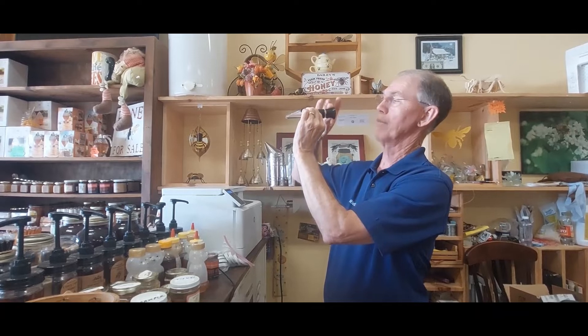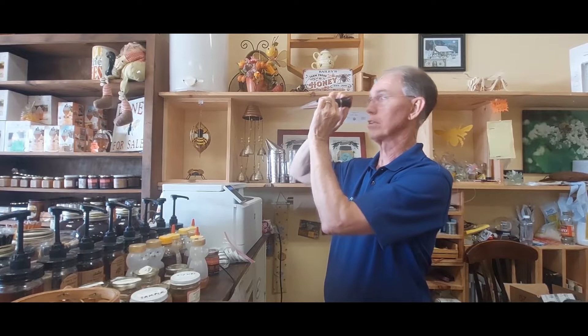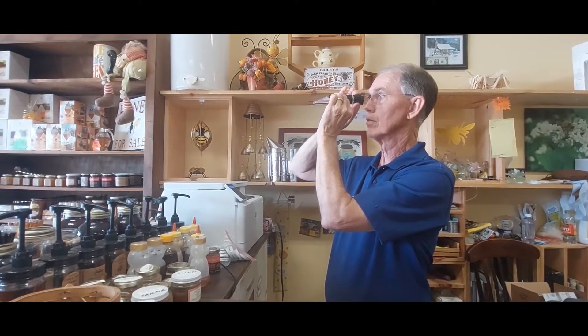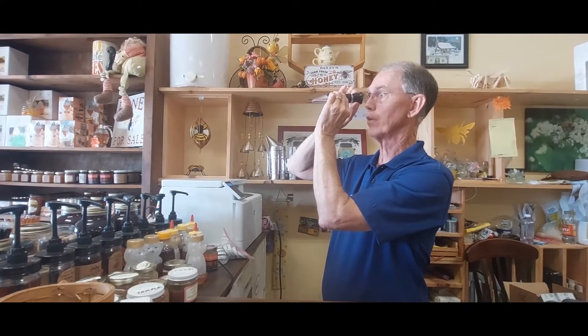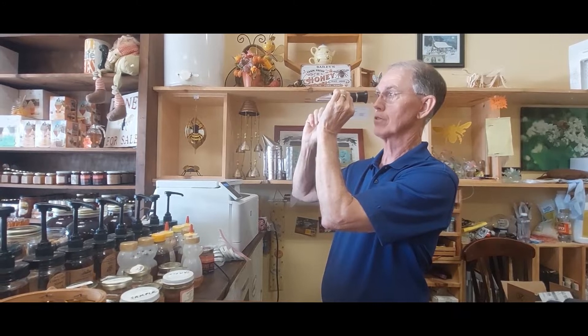You can grab the eyepiece and twist it back and forth to focus it so the numbers are in focus for you. And then you should see the top, you'll see a line, a division between blue at the top and white at the bottom. And that place right between those colors is your line that you want to read.